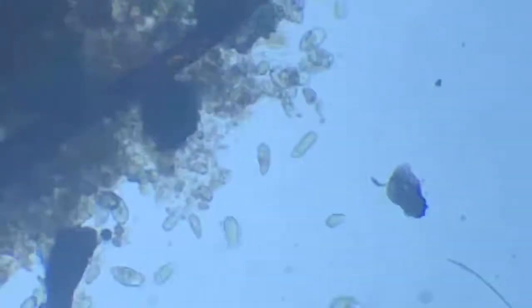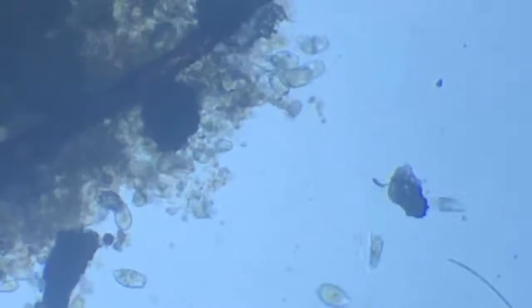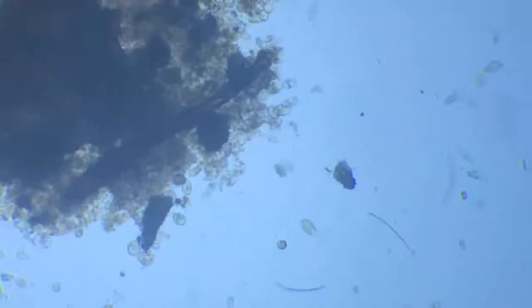All right, so the amoeba have moved out. They are visible. We'll zoom in further and see them. Okay, now we go to the next level of magnification. So the objective will be 10x and the eyepiece is 10x, so we'll be watching at 100x. And the cell phone, since it's recording, has already magnified it twice, so we think it's around 200 times magnification that we are watching.